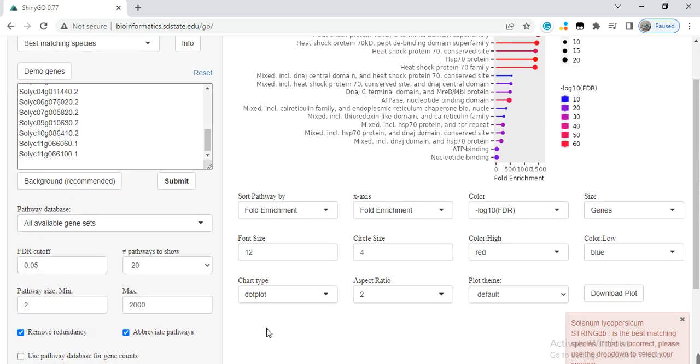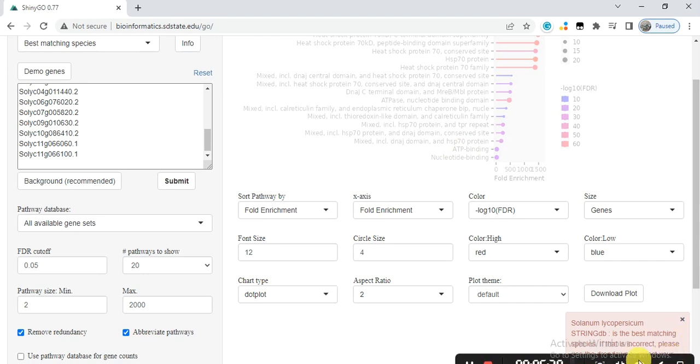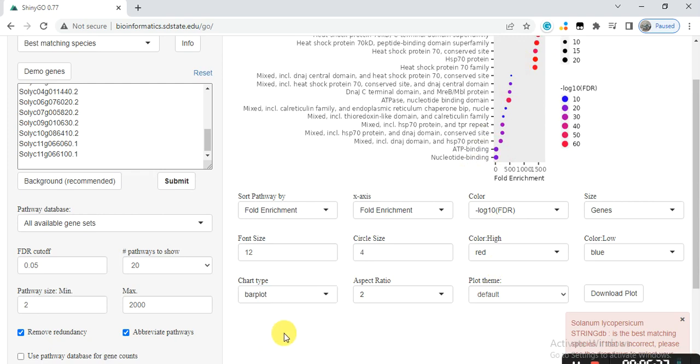From here, chart type, you can change the type. You can change into dot plot or bar plot like this.